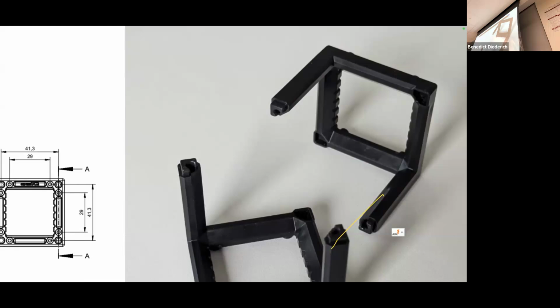With injection molding, we don't have the problem because it's just done once and then done forever. But we fear the day when it's a humid day for production, then the material is kind of expanding because it's hydrophilic. The parts are bigger, the holes are hence smaller, and the fitting is very tight. So there are better cubes and worse.